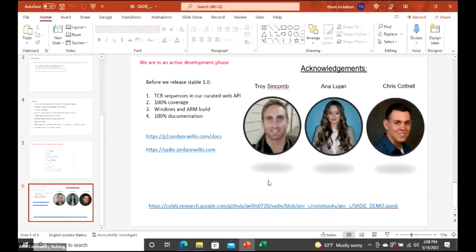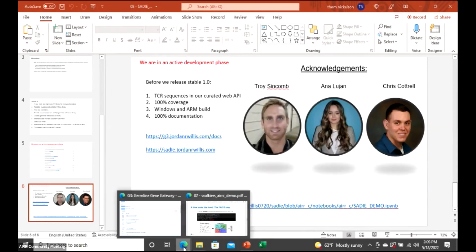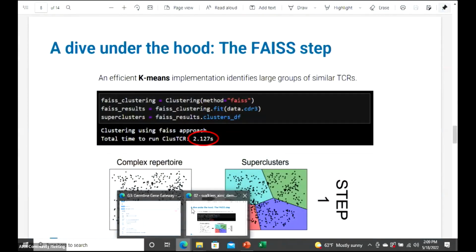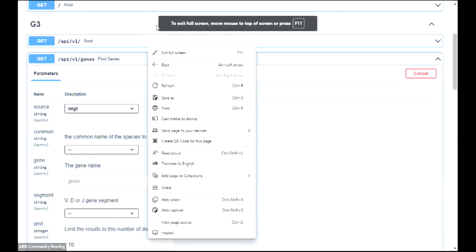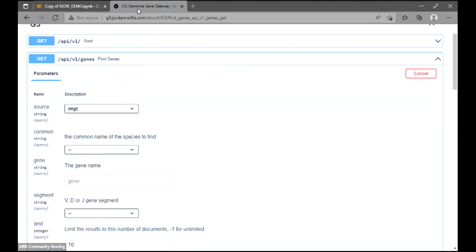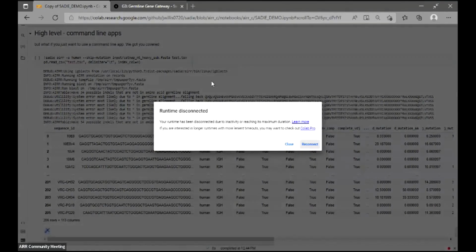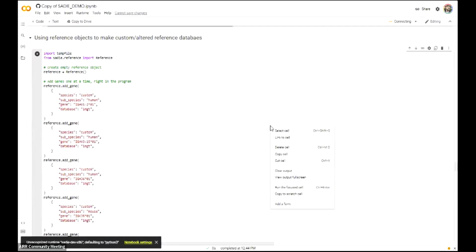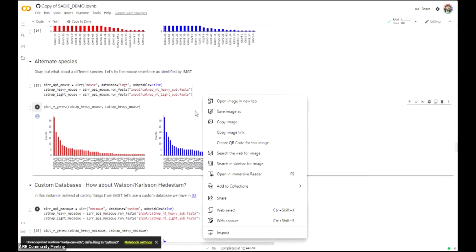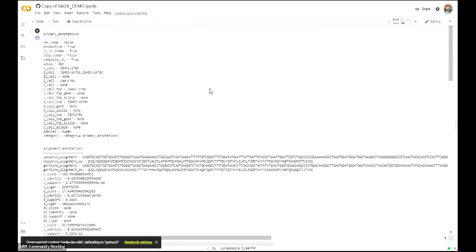So let's see if we can do a live demo. My God, this is scary. So right here. Okay. Where are you? There we are. So, hopefully the notebook is still hot.